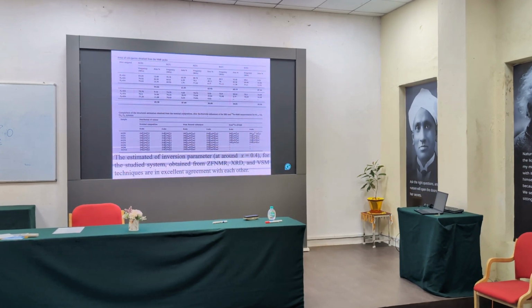In one paper, where I am not directly a part, we have compared Mossbauer, VSM, NMR and XRD. All of them are matching very well along with Raman studies. All those things are there in some of our publications. We just chose representative samples and gave the overview of that instead of getting into the quantitative details. Thank you.